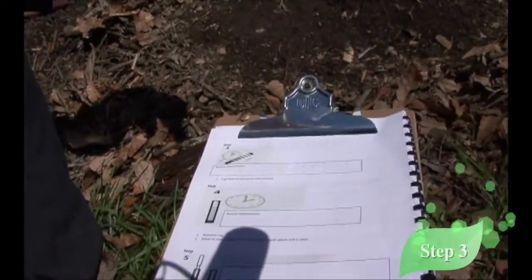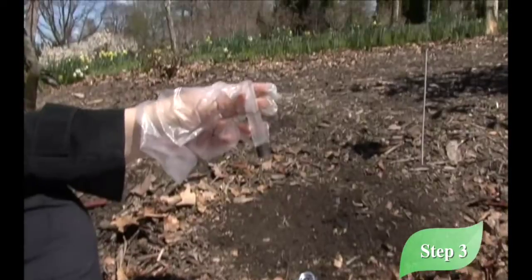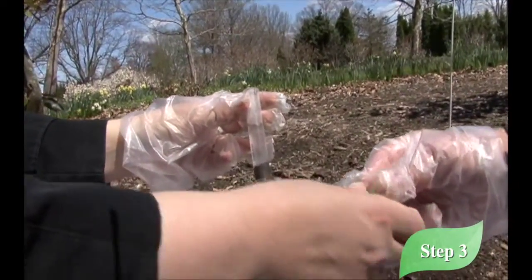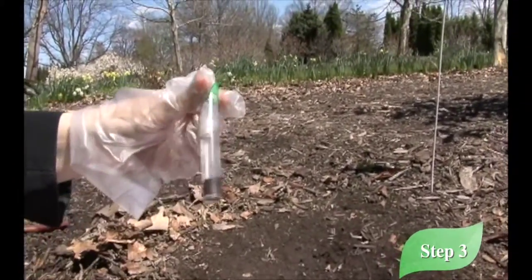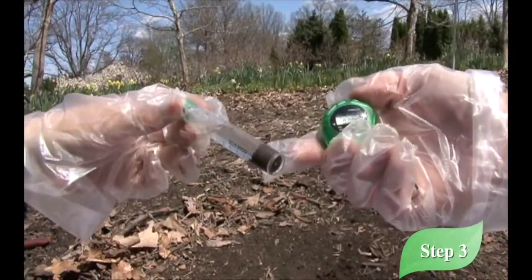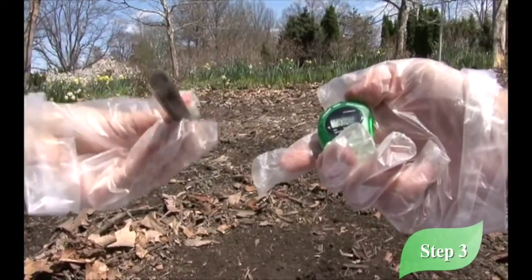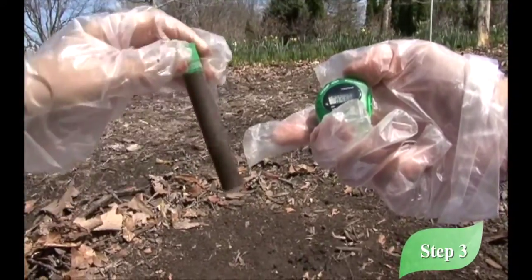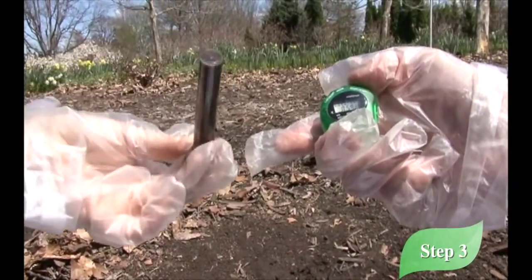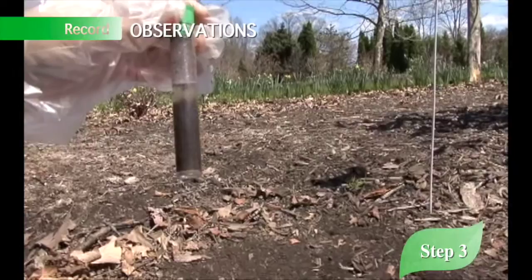Okay. Step 3 tells us, direction-wise, add a cap and then gently mix for 1 minute. We're not going to shake the test tube. We're going to tilt it back and forth. You can get your stopwatch and press start. And I'm going to gently mix it for a minute. Notice it's like a teeter-totter. 3, 2, 1, stop. Wow, we could record all kinds of stuff happening here.